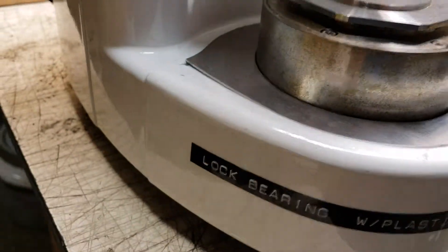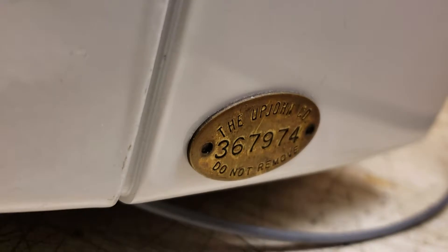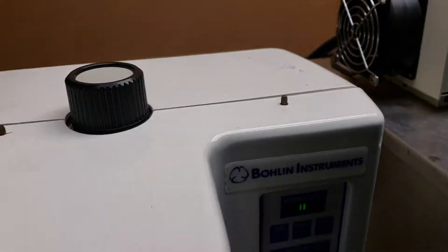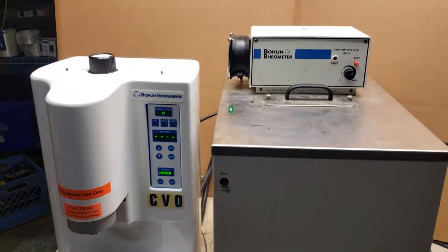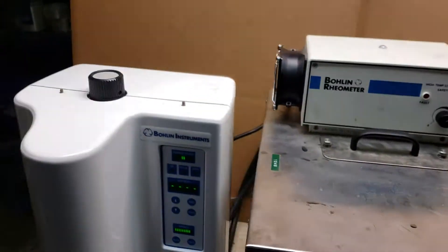I had this piece come down a little bit. This came out of a working lab, so I can imagine that everything was up. And that's the unit — it's pretty heavy, probably 150 pounds. I might be able to ship it FedEx, but I think I'd rather put them on a pallet.